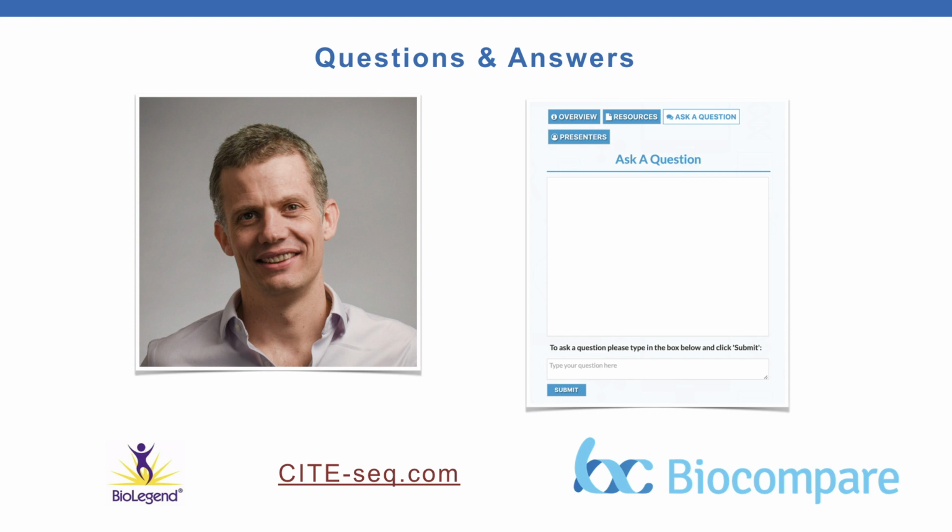So we worked together with BioLegend on this. I'm not sure if I covered this very well in the actual talk, and listening back, but it's important that you try and get antibodies that will decorate every cell.